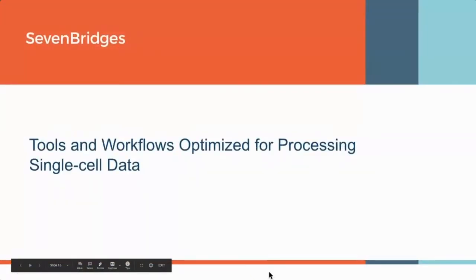Okay, we'll start off with presenting tools and workflows optimized for processing both UMI-based and full-length single-cell protocols.